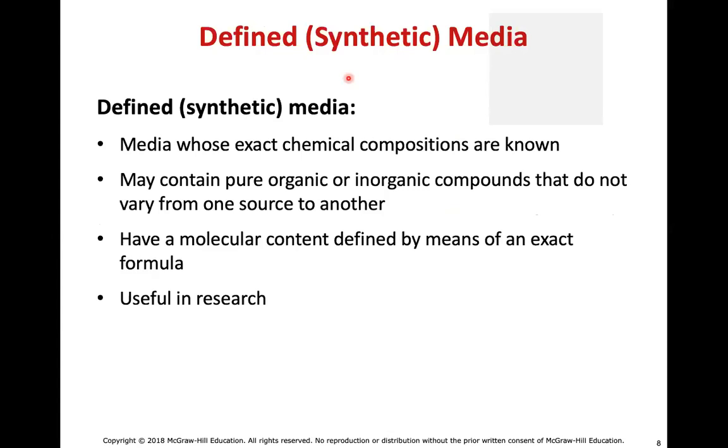Now, there are different types of media. We have defined or synthetic media. Defined or synthetic media is media in which we know exactly every type of chemical that is present. It can contain pure organic or inorganic compounds. It will have molecular content that is defined by means of an exact formula. And this is something that's used in research a lot because they want to really control every aspect of the experiment.